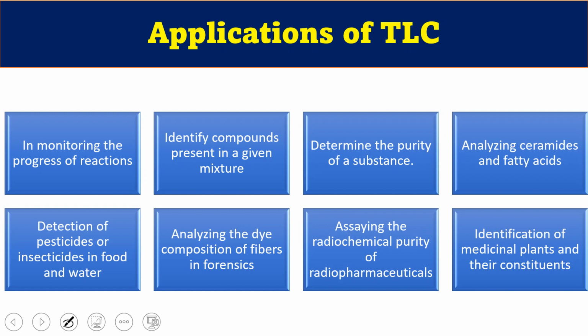The qualitative testing of various medicines such as sedatives, local anesthetics, and anticonvulsants is also done by TLC. TLC is extremely useful in biochemical analysis, such as the isolation of biochemical metabolites from blood plasma, urine, body fluids, and serum. Other than that, TLC can be used to identify natural products like essential oils, volatile oils, fixed oils, glycosides, wax, alkaloids and other compounds. It is widely used in separating multi-component pharmaceutical formulations.